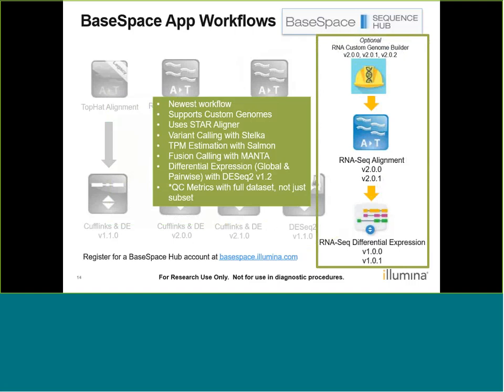Lastly, we have our newest workflow, which is highlighted here. I'm not going to go into a whole lot of detail since we're going to detail this further in the next portion of the talk, but I will point out that this workflow is significantly different than the previous workflows because we're going to be using TPMs, transcripts per million, for abundance estimation. So again, we'll talk about this further, but I did want to point out just a few other things with this.